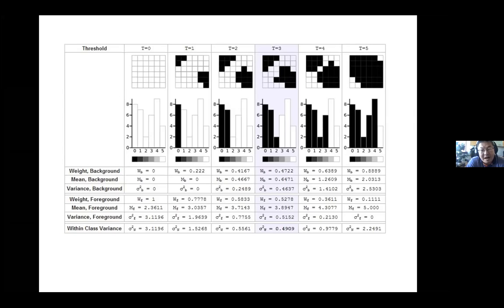Okay? My job is just to make sure I use the same algorithm on all the images. Then we make sure that when we compare them, they are treated the same, so we are analyzing in a consistent way. If they show a difference with statistical significance, we will think it's a reliable result. Okay?